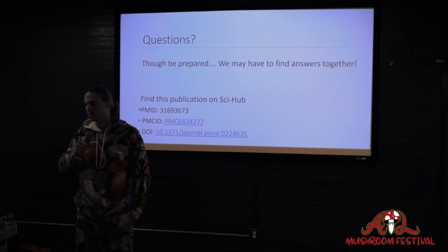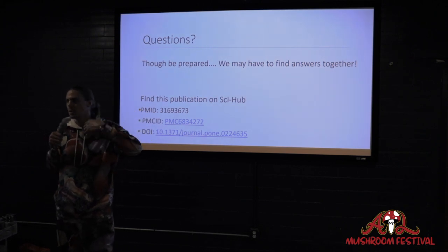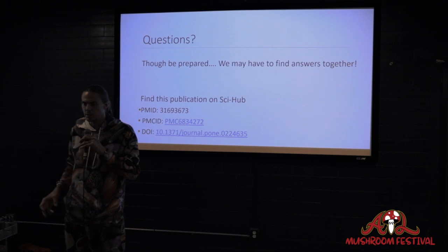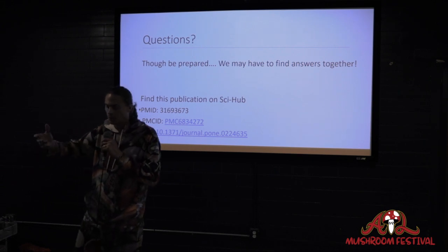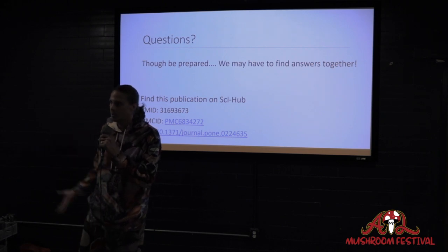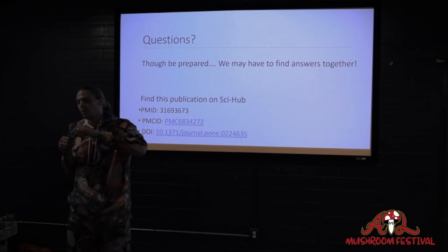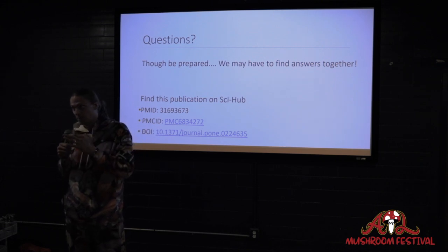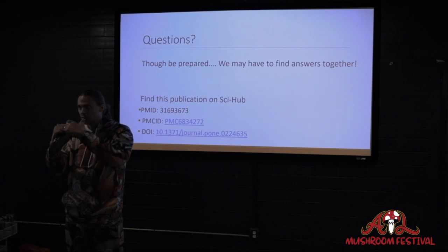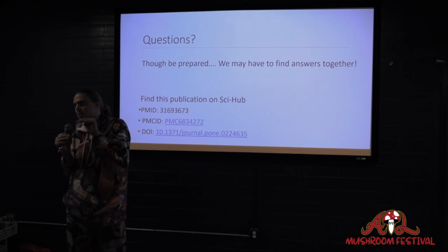It's not fruiting on the plate, and when you put the selection inside of the cabin, you're making a high CO2 environment. So you're not inducing any sort of pinning or fruiting state to the mushroom. So it's staying in secondary mycelia mode, and so it's really just trying to, it's like, oh, I'm trapped. How do I grow? Like when a culture is in leaf litter, it's going to keep growing until it hits air. And that's essentially the same type of thought process you're doing here. By putting it in that cabin, you're forcing it to say, okay, now I've got to grow through this material. And so when you place the roof, and the roof is larger than the hole, so there's that overlap of the roof around the edge. And if you press out all the air bubbles, and it has complete contact, then it still has to grow through that agar. And so it's not like it's somehow slipping in between. It still has to grow through.